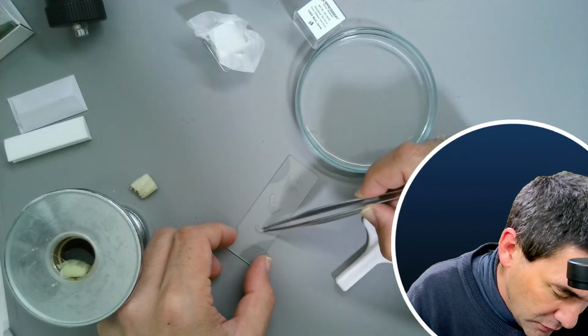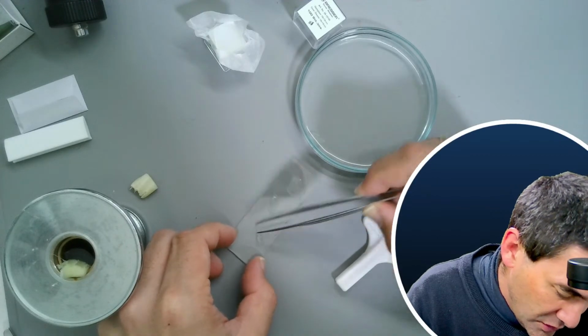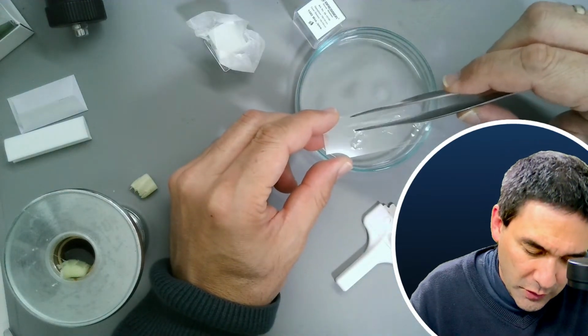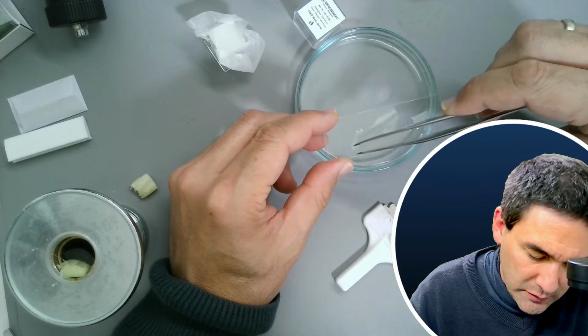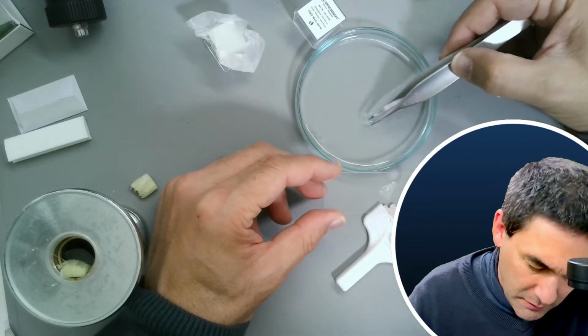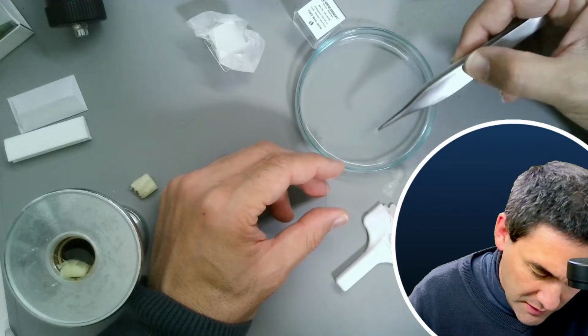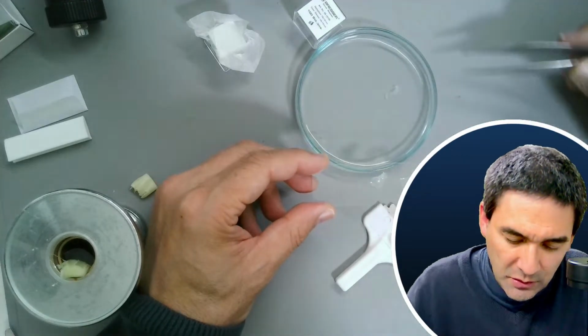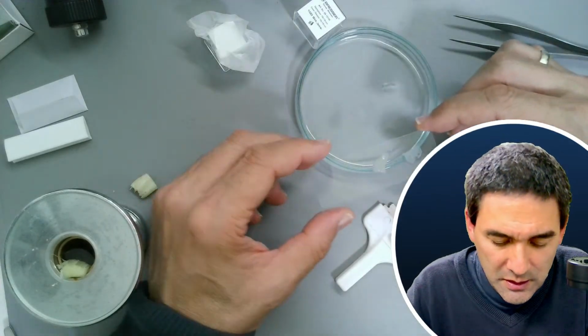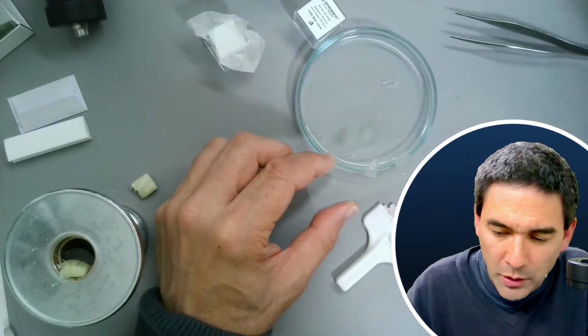This is difficult, of course, because it likes to fold over. If this happens, maybe I'm going to put it back in again here, and then somehow the surface tension of the water makes it difficult. You know what I'm going to do? It's already a little bit messed up. So a little bit more water maybe.